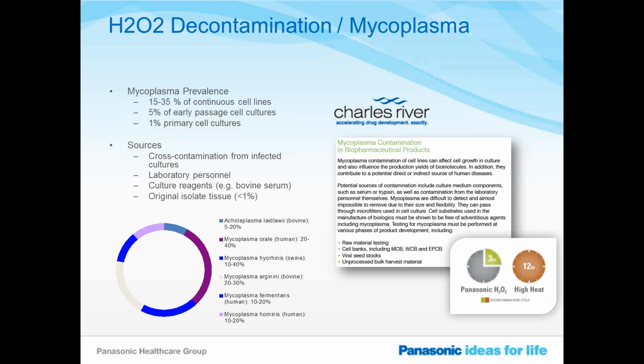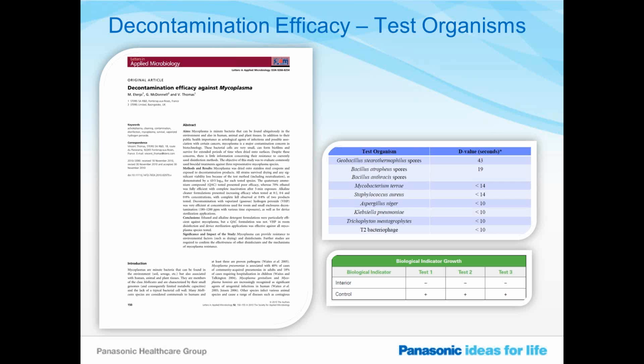And really what we're going to try to do with some of the efficacy testing is to show not only how well it works, but also the speed at which it works, and also talk a little bit about why decontaminating an incubator, with it being such a small area, when you have a bug like Mycoplasma, is so important to not only decontaminate in quicker fashion, but also to eliminate the bug quicker from the environment.